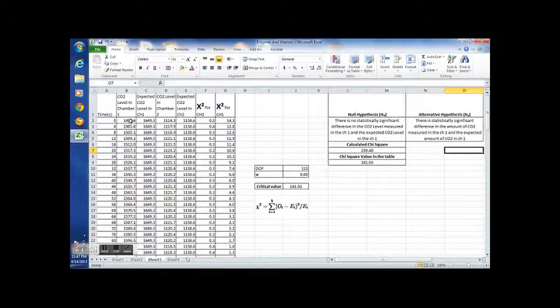So as you can see, this change is pretty significant, indicating that there is something happening that is different than usual. Glucose is not just sitting there, it is being broken down. According to our idea, it is being broken down by the enzymes extracted from the yeast.